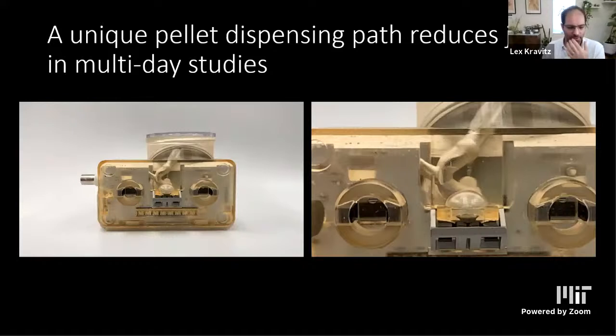These are some FEDs that were printed in a clear resin, and I'll show you the pellet path again, just because these videos came out super cool. Another aspect that we spent a long time on was trying to get the pellet to land directly inside a sensing mechanism. Many pellet dispensers dispense a pellet, and it goes into a little cup or maybe just into the cage, but it's not being monitored. An important part of FED was that we want to know that the pellet is there, and we want to know when the animal takes it.